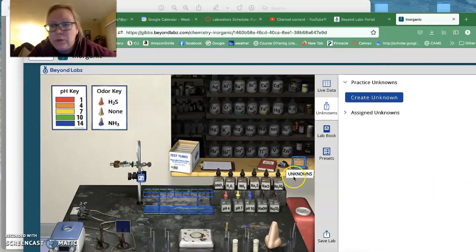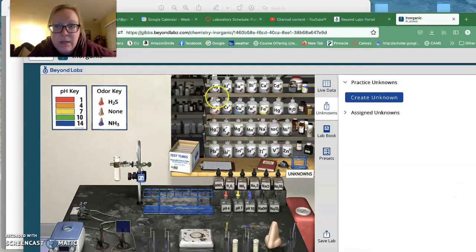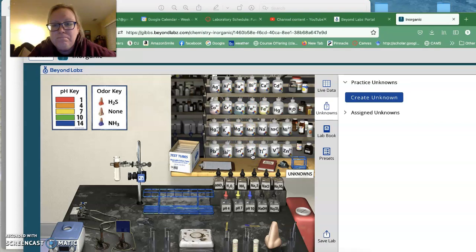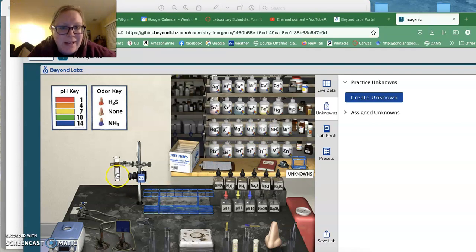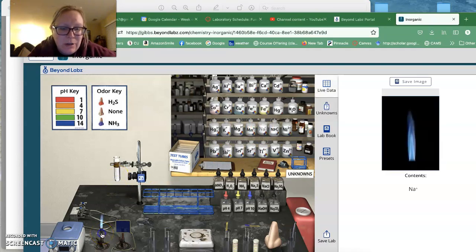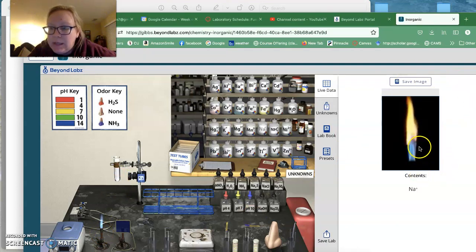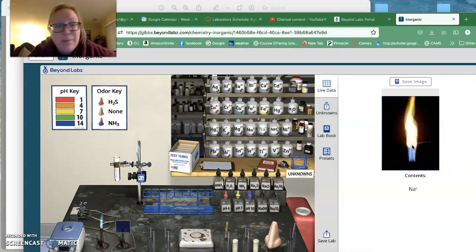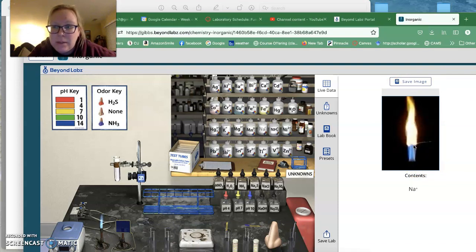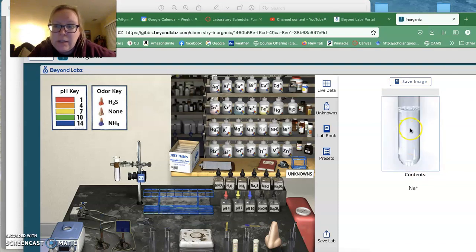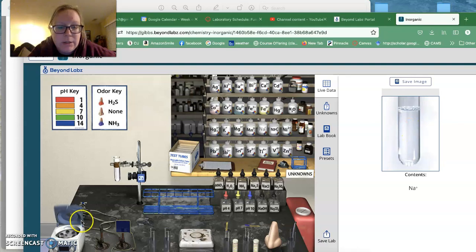So let's look at how we're going to do this. First, we're going to take a test tube and let's look at sodium first. So we are going to find sodium. And so what you then do is then you click on the flame and I want you to look over here. And what's happening is they're taking a rod with sodium in it, like a metal wire, and they're putting it in a Bunsen burner. And you can see that the flame here now is kind of a yellow orange.